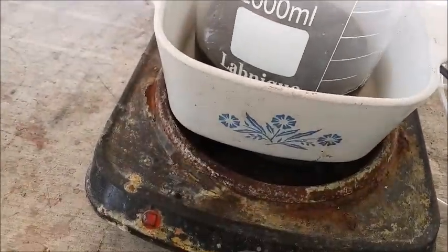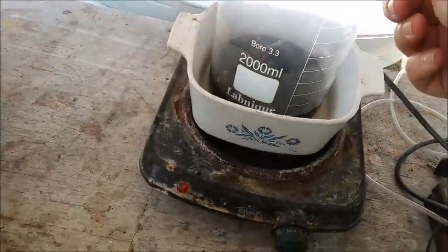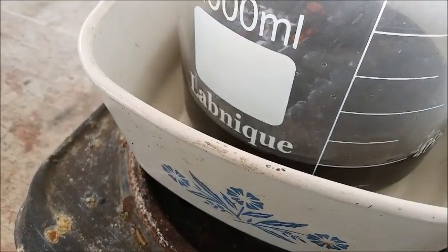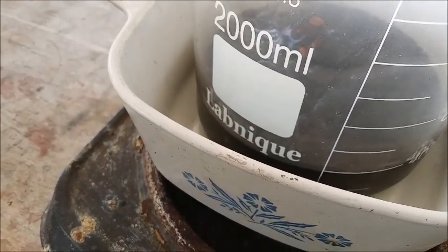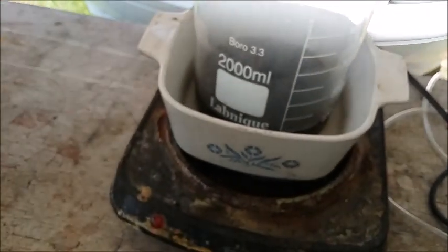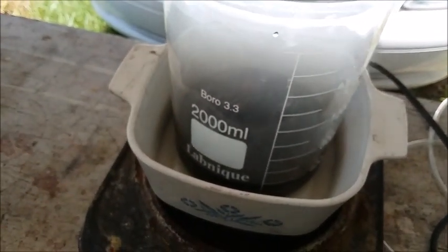All right, it's been about 20 minutes or so. This is heating up. The acid has turned pretty black, starting to fume. The reaction has begun. I don't know if it's showing up on the video or not, but some of the epoxy tops in there are starting to swell up and fall apart. So it's going to get even nastier here as it heats up. I'll give you another look at it in a little bit.